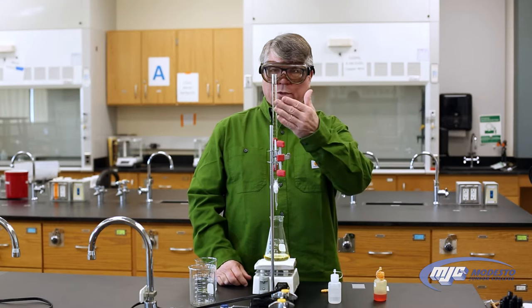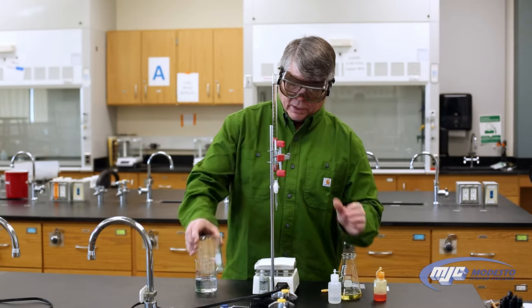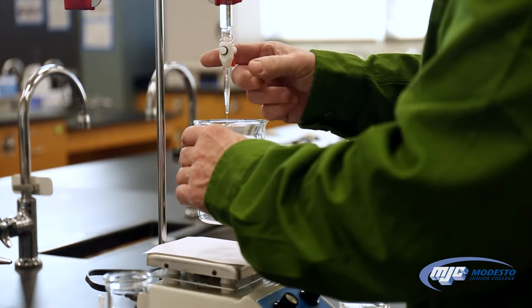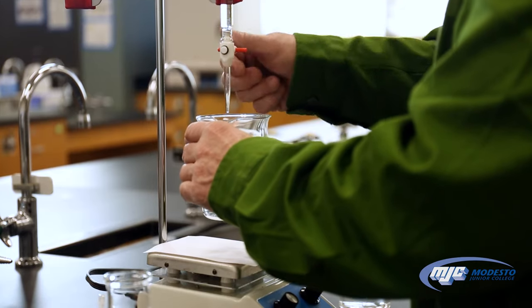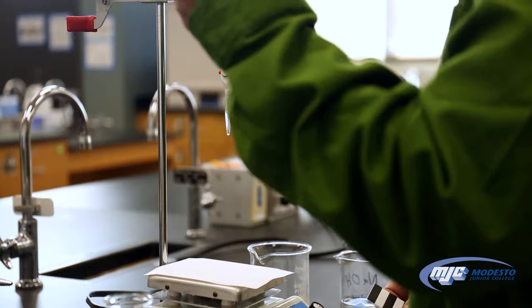When I have the sodium hydroxide in the burette, the first thing I want to do is make sure I get the air bubbles out of the tip. So I'm going to open the stopcock and give it a little flick — there we go. I'm going to check the level up here and make sure it's somewhere below the zero mark. It is, and I have all the air bubbles out of the tip.